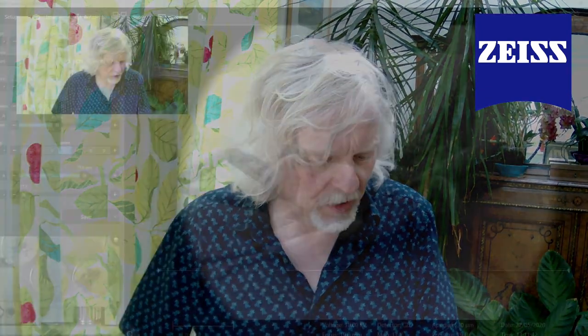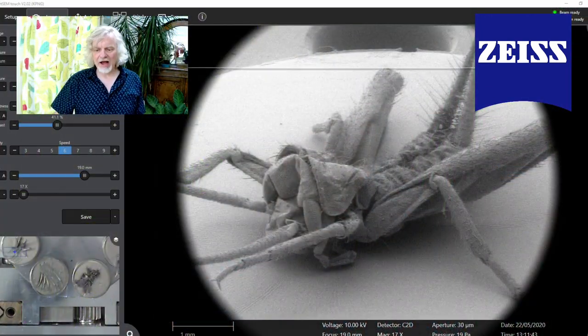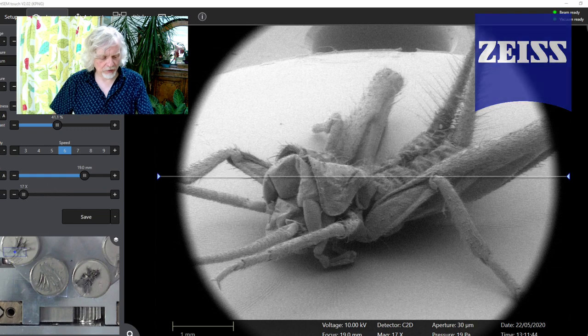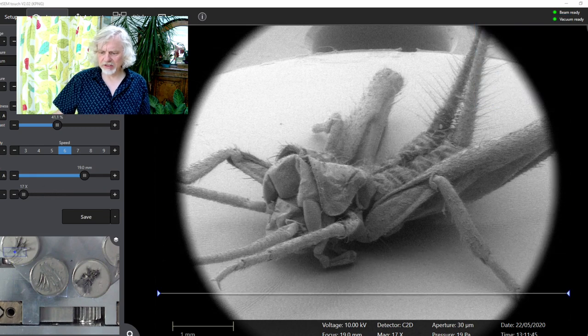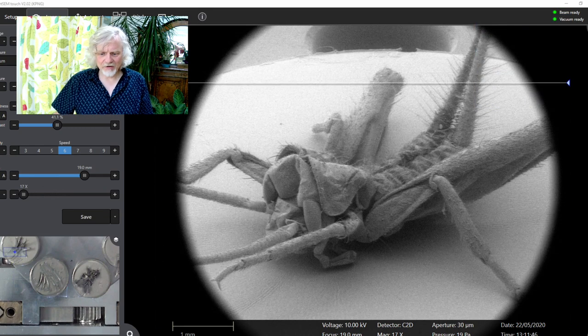So I'm going to pull up the actual microscope itself, because I'm seeing it on a screen here, and controlling it with my mouse. So let's pull that up. If I do that, it should come up and I'll put Zeiss away. And there it is.